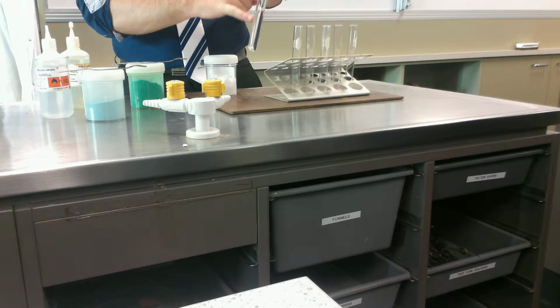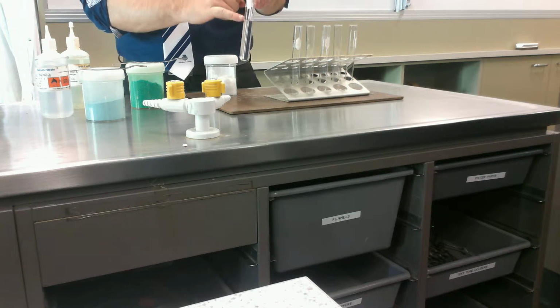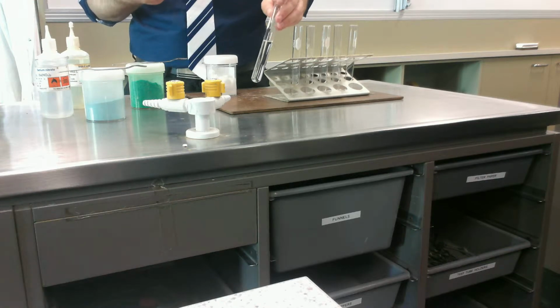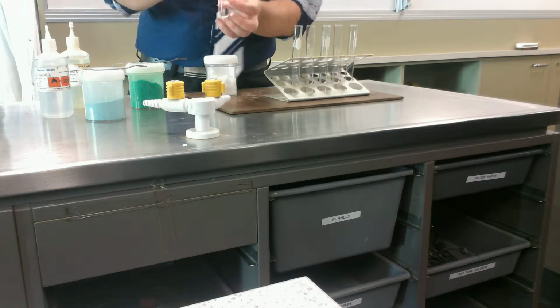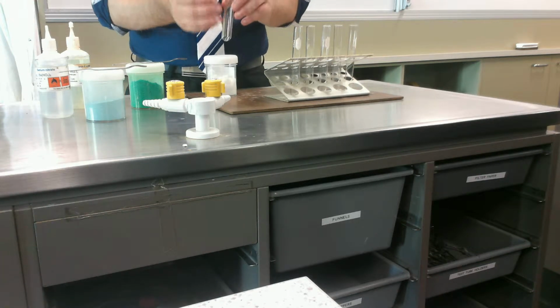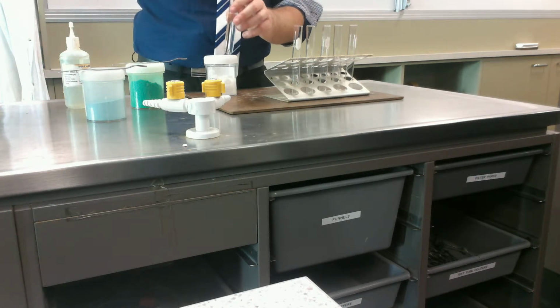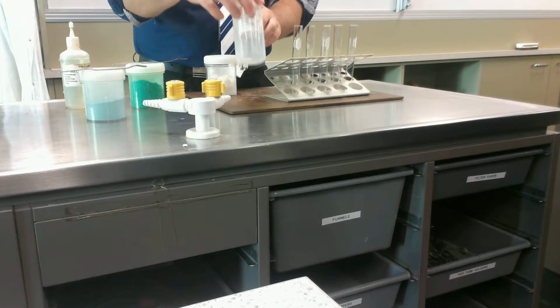What colour is this here? It's the same colour as what? Water, which means the word we use is colourless. Because there's no solid bits floating around it, we know it's a solution. So this is a colourless solution. So just like this one here, barium nitrate, which is also a colourless solution.